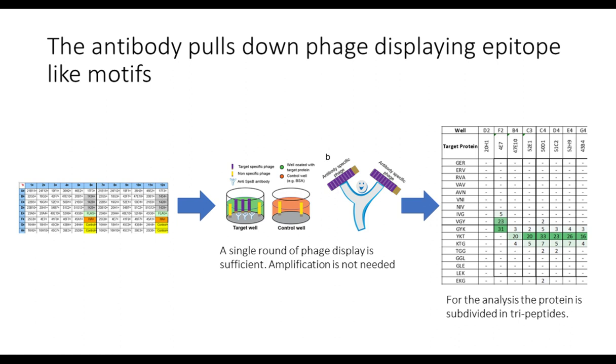So if we look at the antibody clone 4E7, this is the epitope where it binds. The bioinformatical analysis for this was done in tripeptides. So we chopped up the protein SPSB into tripeptides, and we're matching the sequence to peptides where we see a good signal-to-noise ratio.